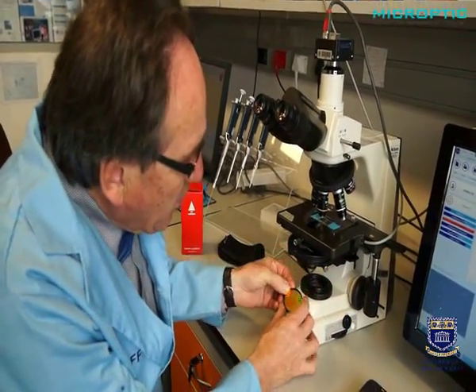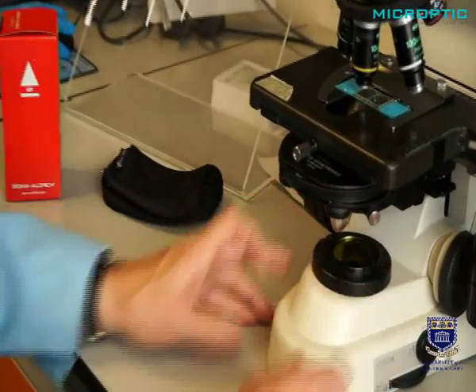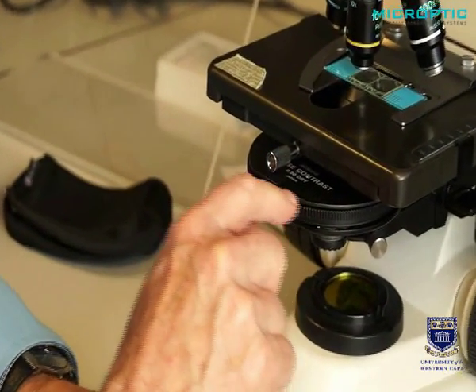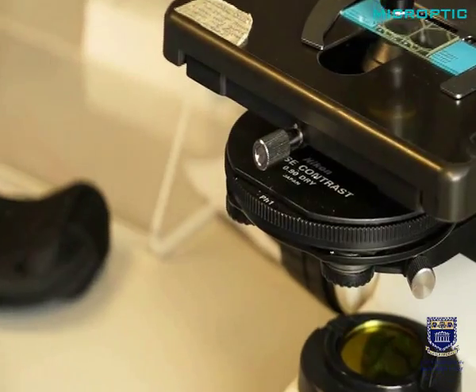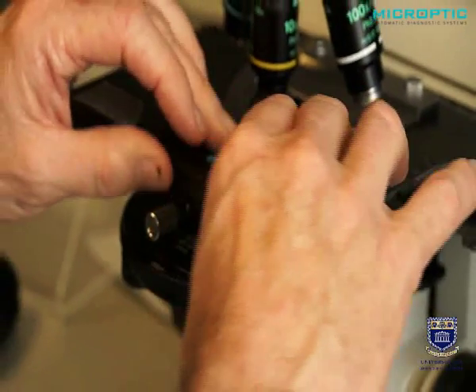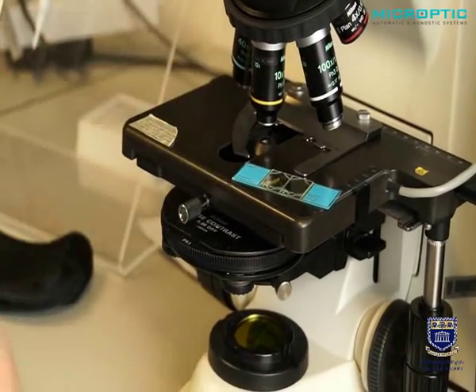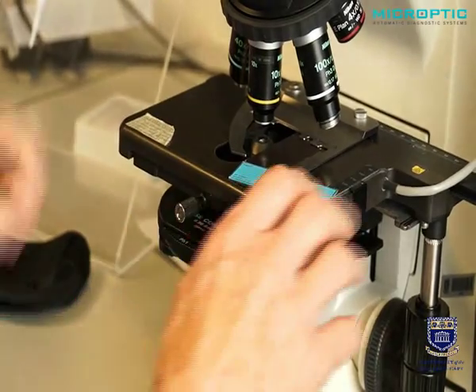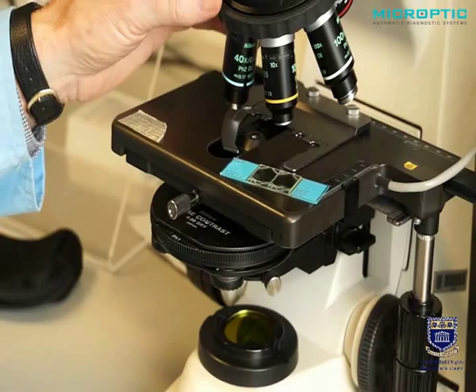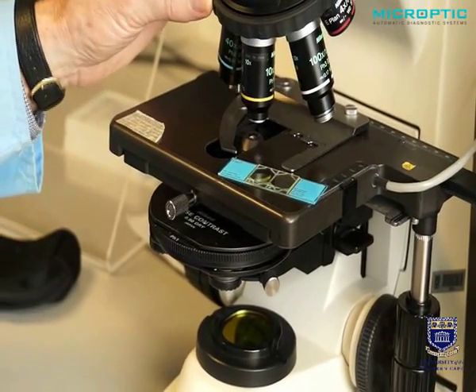It has a green filter, which is essential for positive phase and negative phase contrast microscopy. It has a phase contrast condenser, and then of course I've indicated the heated stage. Before we do any measurements, we heat up the slide here also, and we fill the slide. And here we have a 10 times positive phase lens, which is required.